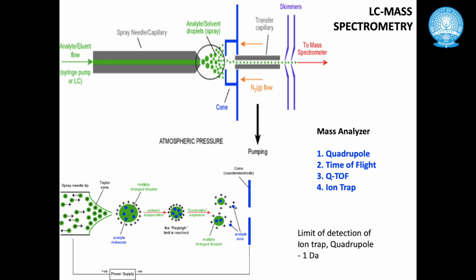At this exit end, there is spraying of the eluent, and from this spray end, droplets of the eluent or the mobile phase carrying the analyte come out.